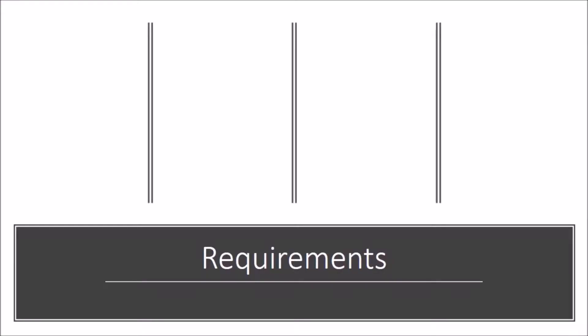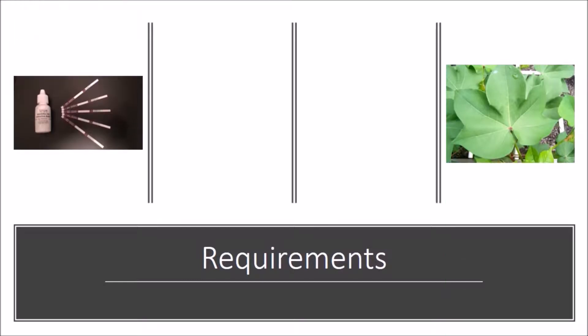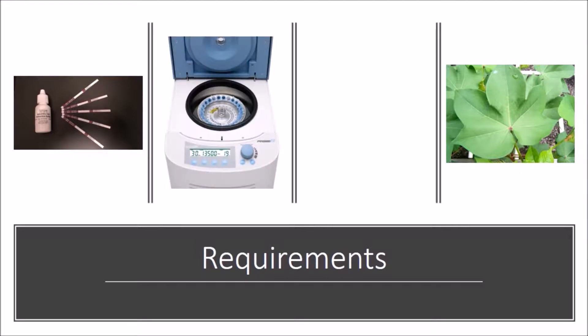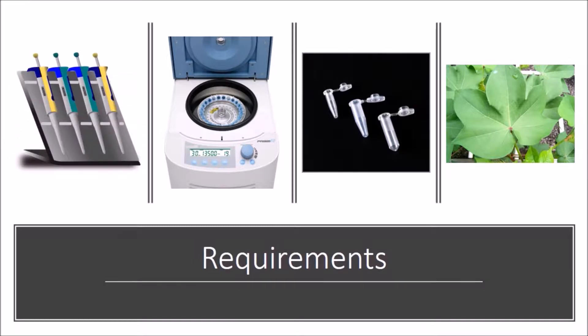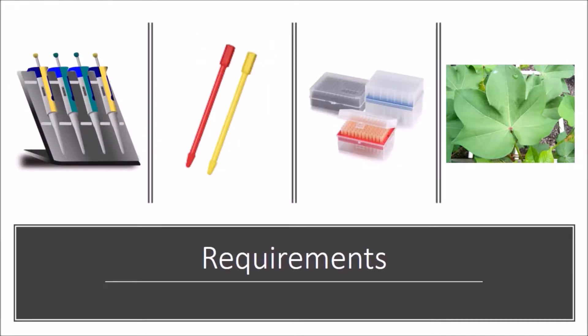This is a quick and simple test for cotton plants and requires the following: a sample of a young leaf of the plant being tested, a transgene testing kit containing testing strips and a buffer, a microcentrifuge machine, Eppendorf tubes, a pipette, pestles, pipette tips, and gloves.